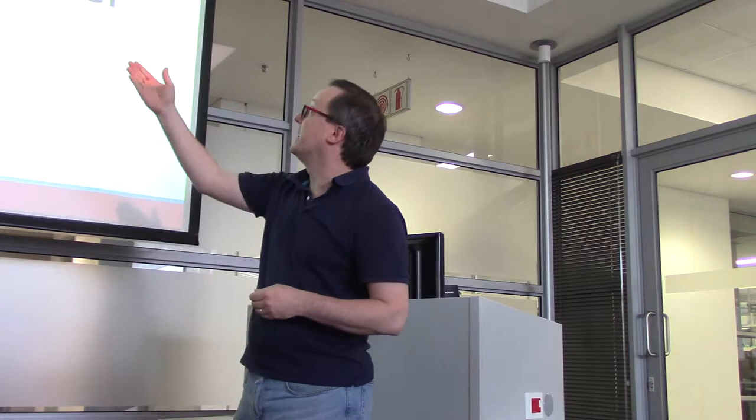So today we're going to start with bioinformatics. I have to be the first to admit that this is a bit of a drinking from the fire hose phenomenon. This lecture covers a lot of topics. But what I want you to understand is how we get from something the sequencer dumped out to an annotated genome. That's a pretty long stretch of things. So the first part of this process is one that we're going to call assembly. How do we work from a bunch of reads off of a sequencer into long stretches of sequence, to contigs or chromosome style pieces of DNA? And then how do we determine what the important bits of that DNA would be? We speak of this as the problem of annotation. How do we find where genes are? How do we figure out what those putative genes do? So assembly and annotation, then, are these two key processes that frame all of today's talk.